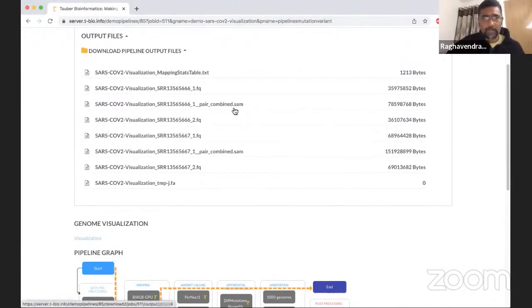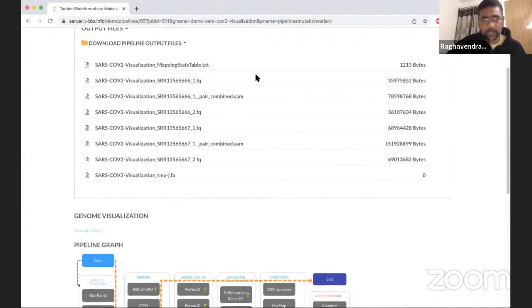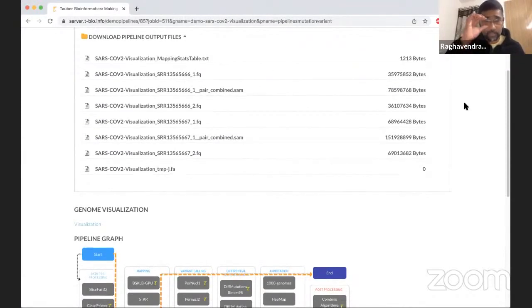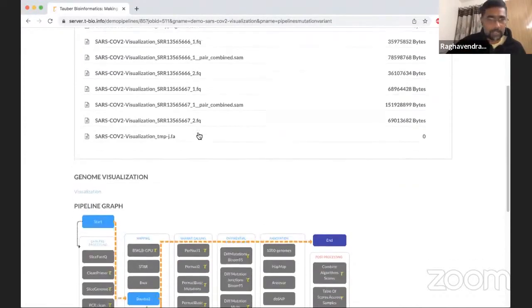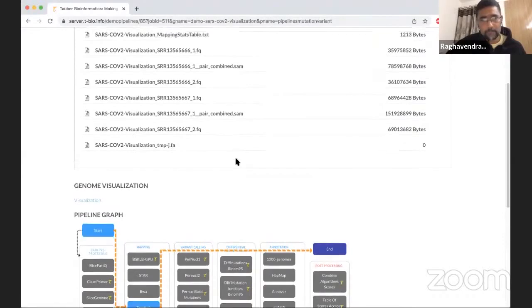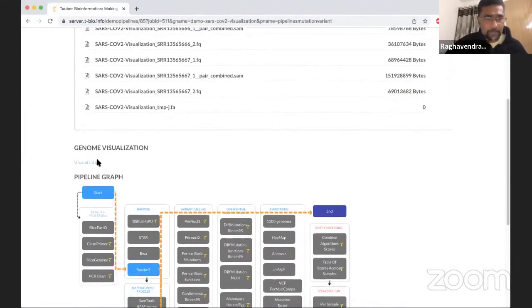We have the sequence alignment map — or SAM file — which is the alignment file in SAM format. This can also be given in binary format as a BAM file — a binary alignment map file. We also have the input FASTQ files provided for this mapping analysis, and this is the reference genome. From here, we can further explore the pipeline outputs and perform downstream analyses.